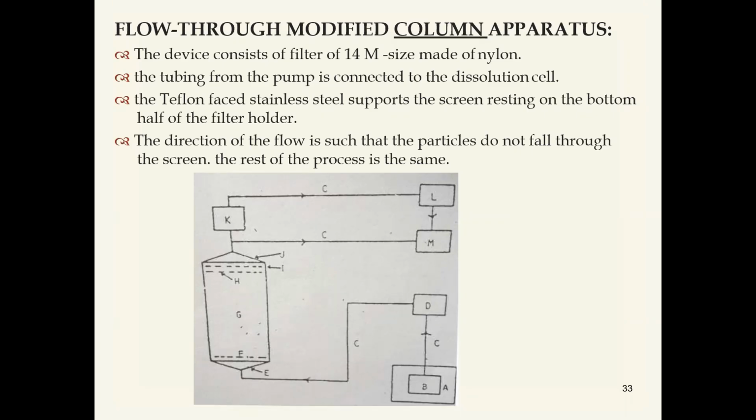I is there. Here, I is the gasket. J is the parts of the filter holder. This is also a filter holder only. Next K. This K is a standard tube. Next L. L is the flow cell. M is the receptacle.